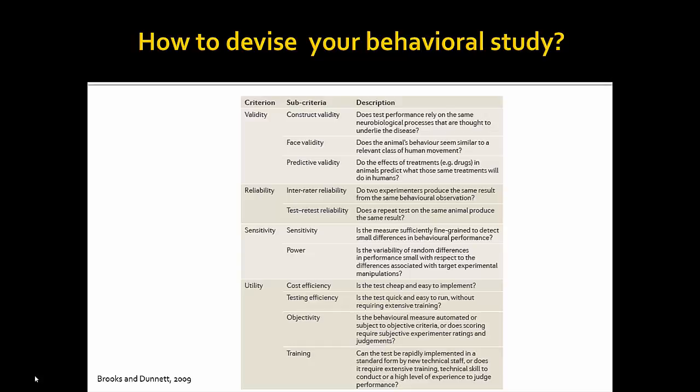And then next you want to look at reliability. If I do the test and then somebody else in the lab does the test and is blinded, are you going to get the same results, or completely different results? And is it sensitive enough that if you move your apparatus from here to here, you're going to get 2 different responses? You have to think about those things when you're looking at your test.